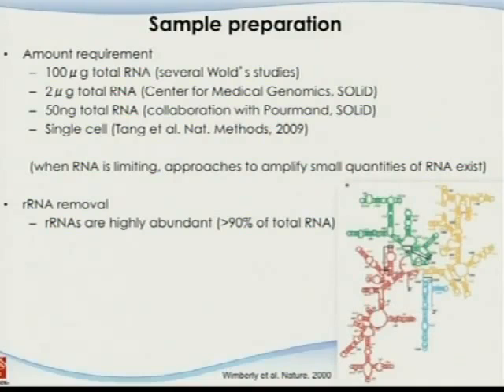We had one study in collaboration with an investigator, I think in Columbus, Ohio, at a hospital there, and they study bacteria. They are trying to do RNA sequencing using the Illumina platform. We were very happy about that and said, good, let's do it.